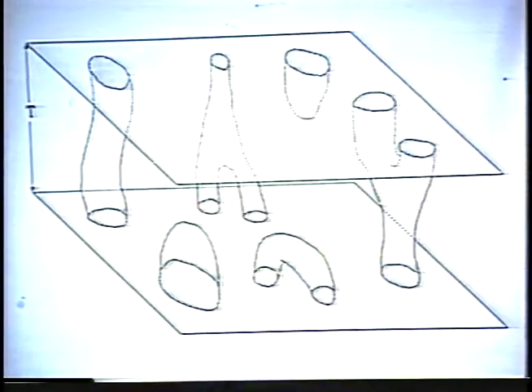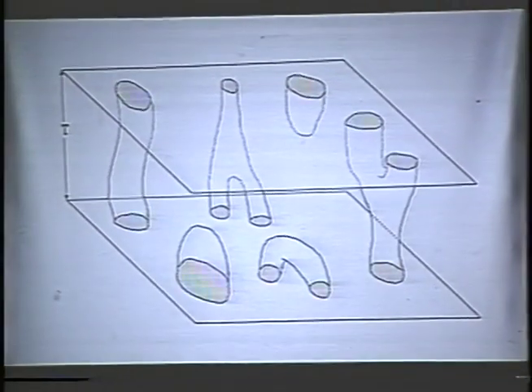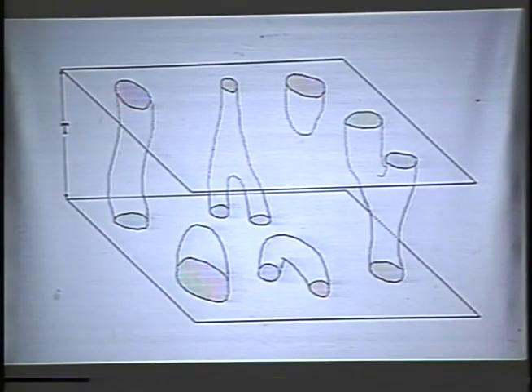The next slide shows another example of some of the limitations of thicker sections. Here are some structures which are bifurcating. And if we just image this as one section and then projected it onto a two-dimensional micrograph, it would be very confusing. You wouldn't recognize that these structures are dividing. So in order to get the space resolution in the z dimension, we then need to cut sections to divide this. So you need to determine, on the basis of the system that you're working with, the ideal section thickness.